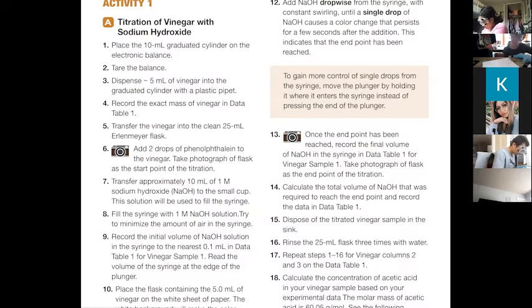So you'll probably go to like 3.5 and then slow down. There you go. Go to the 7.5. Okay, that makes much more sense. Still in half. No, you can just go right there because we know basically what it's going to be. That's very pink. But it will go away.